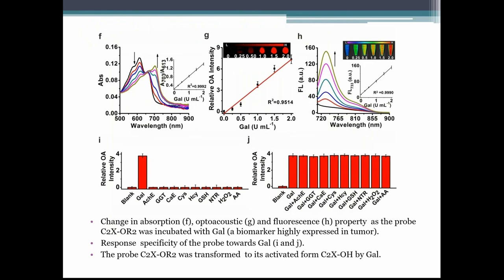Following the experimental protocol, the response of probe 2 towards GAL was also investigated. It's clear that probe 2 also exhibits a remarkable redshift in absorption, as well as prominent fluorescence enhancement upon incubation with the enzyme GAL. These spectral results clearly indicate that the two probes can potentially be employed to image the corresponding biomarkers in both optoacoustic and fluorescent manners.